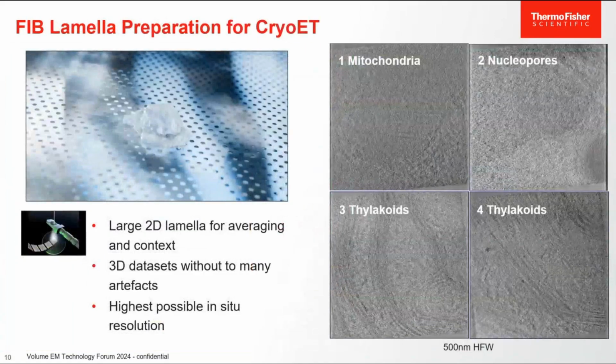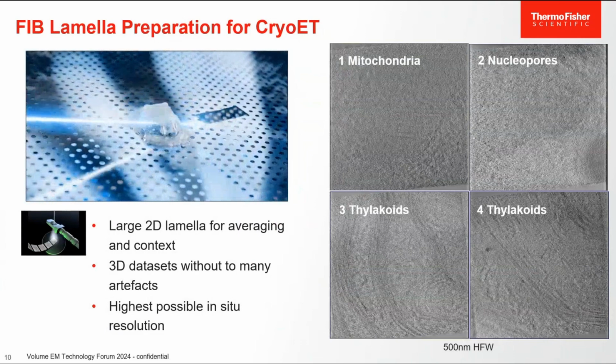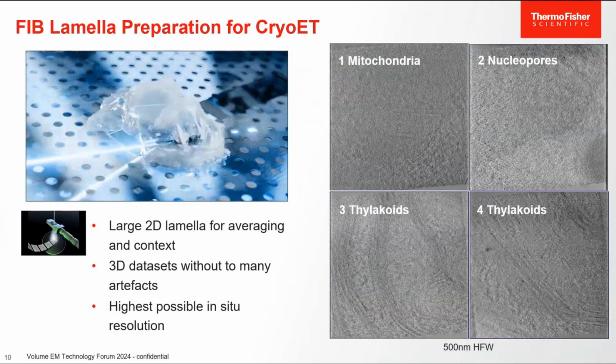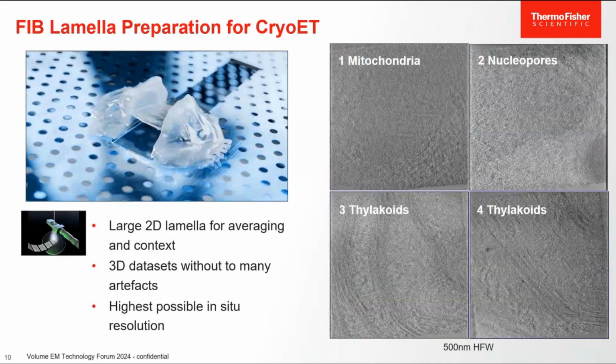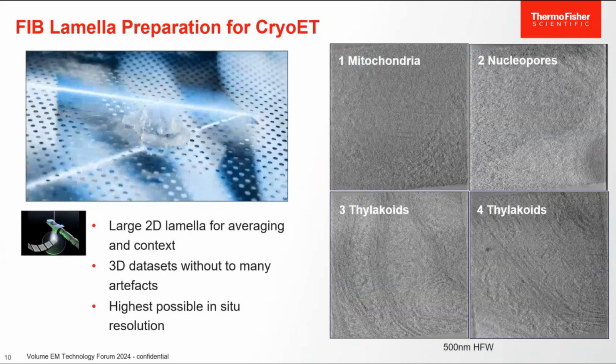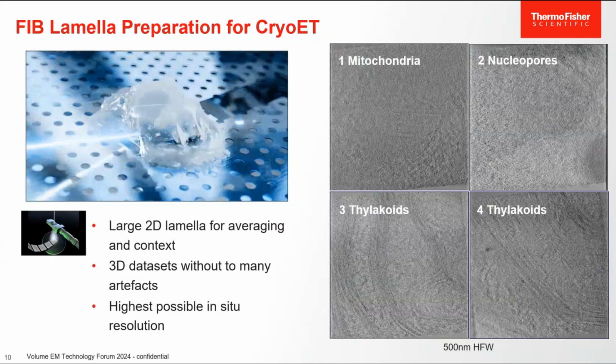So you can also do cryo-ET, and I say that's not the focus of a lot of people here, but you can also mill cryogenic specimens. I'm showing here a movie which is doing a single cell on a TEM grid, but I think you will see some presentations during this session from people working on tissues and other things. So now this is being opened much more to a bigger field.